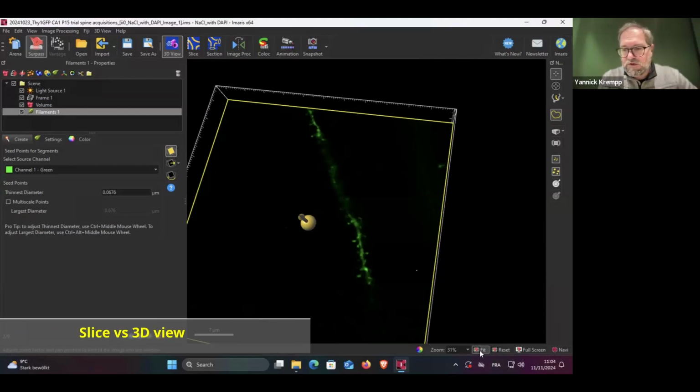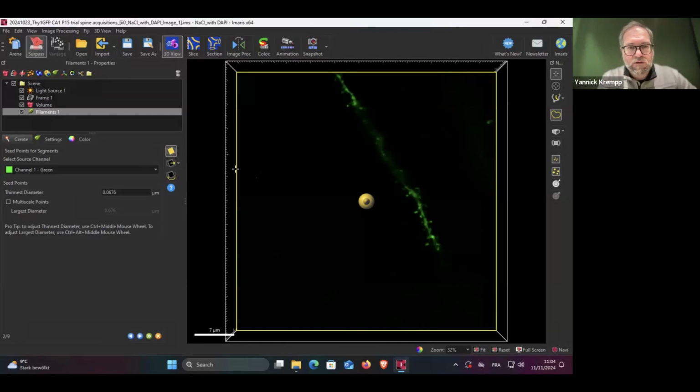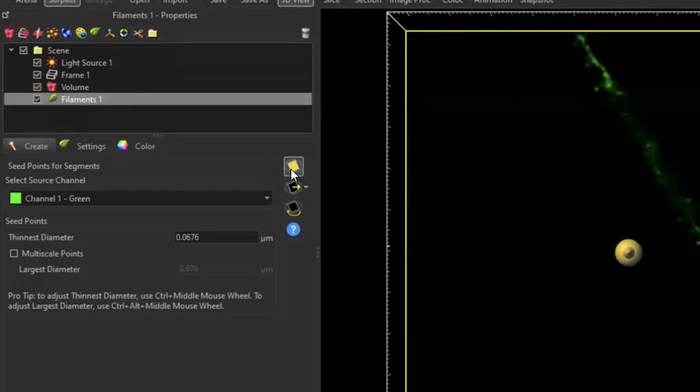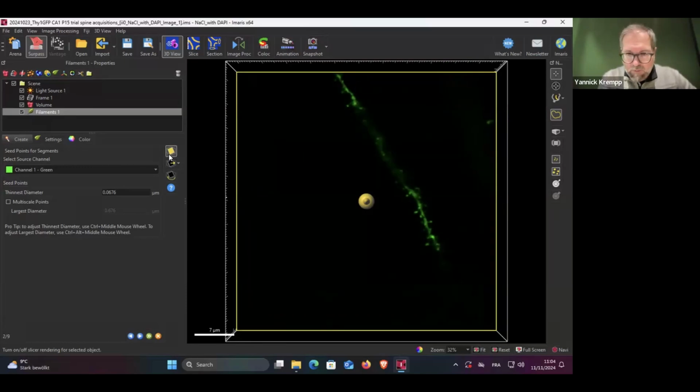And so let me just reset the view here quickly. We have now, by default, a 2D view enabled. So you can disable this by clicking here on this small button here. So you can see the full 3D data set or just one plane out of it. And you can grab this sphere here. So please do not grab the center one because you will change the orientation.